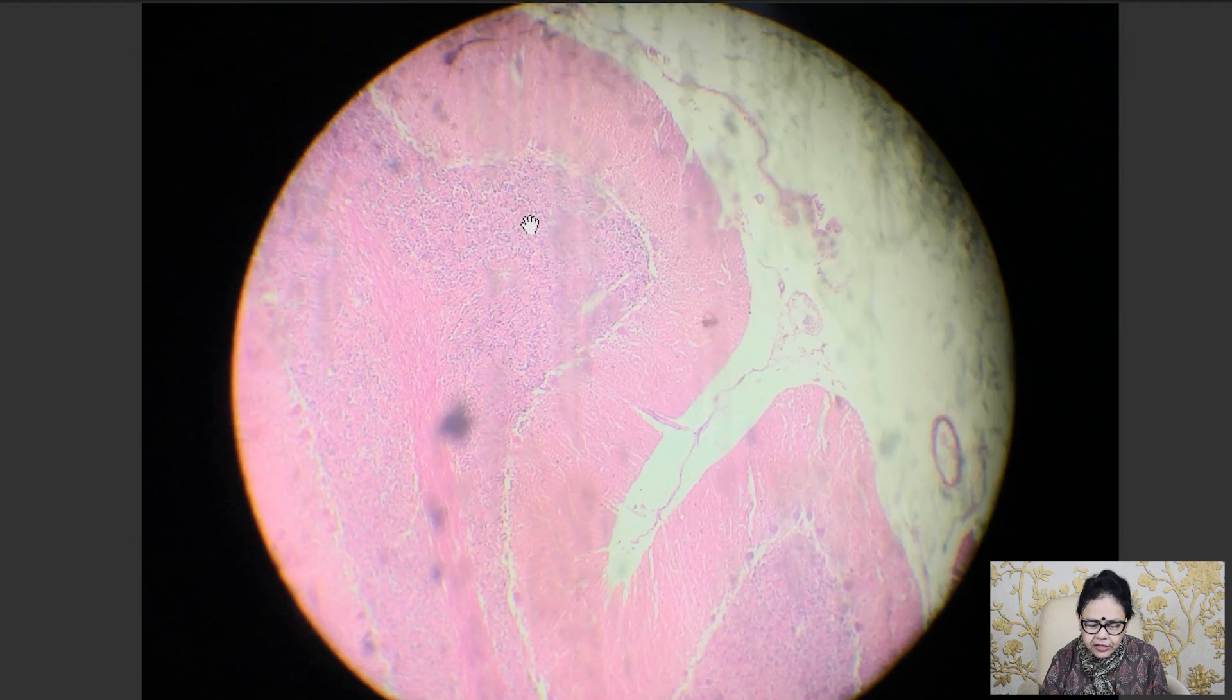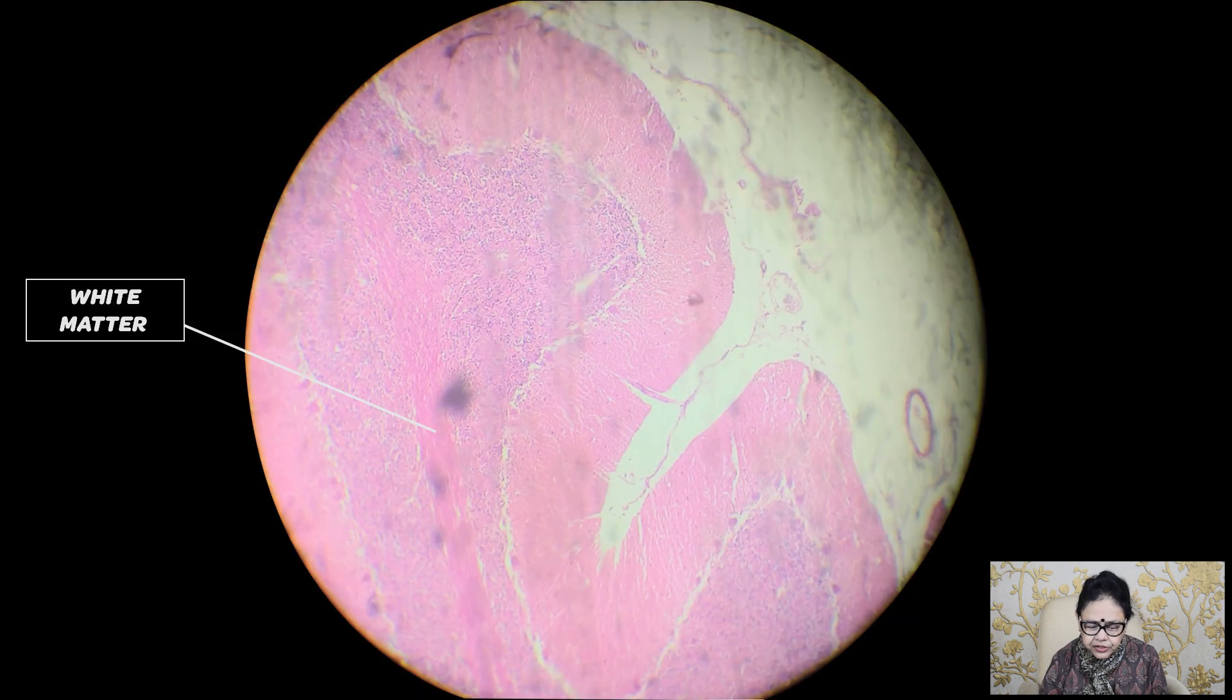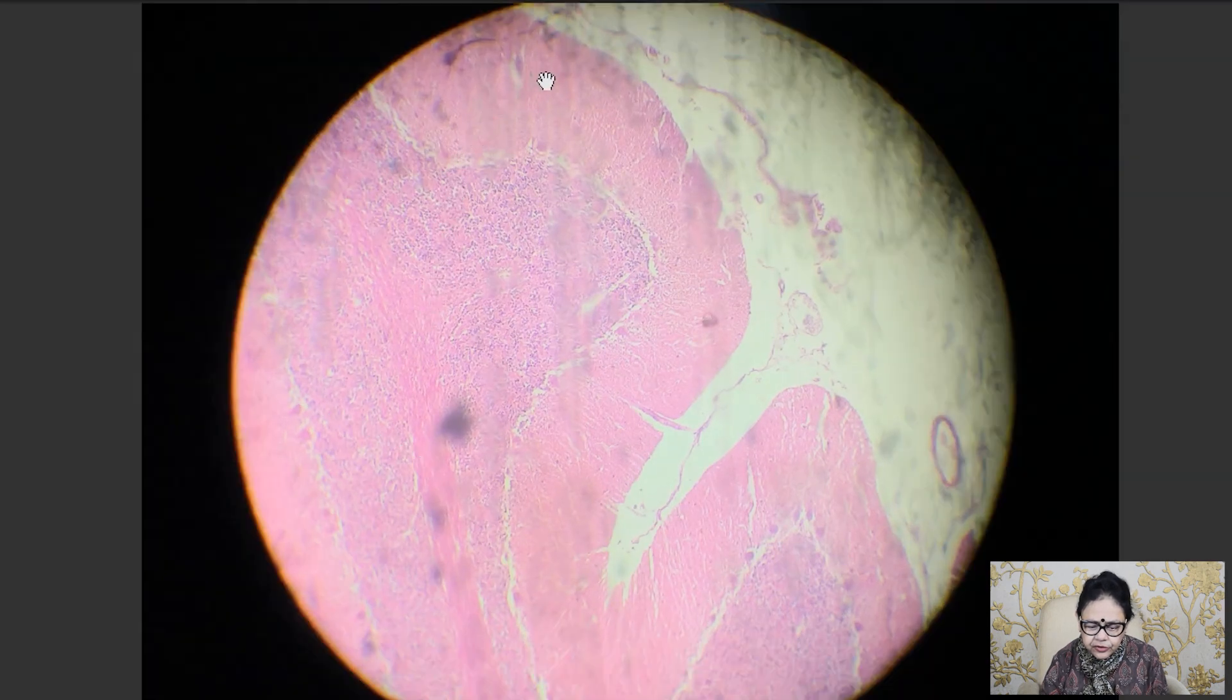Next to this Purkinje cell layer, you will see the granular cell layer, which is dark stained, blue stained. Inside the granular layer, you will see another pink color structure - that is the white matter in section.